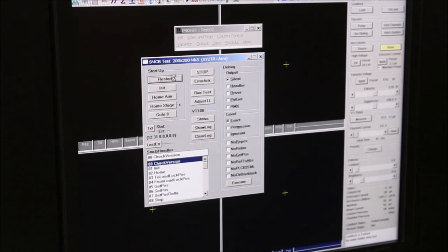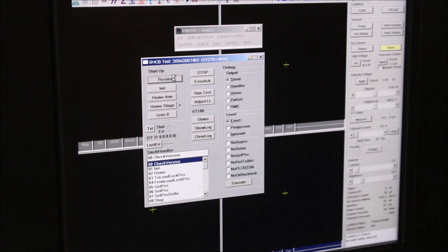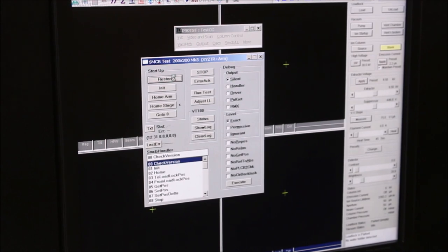Now we hear the motors going. When the sump is removed, we can hear the motors homing the stage. Now it's going to go to zero zero. If something goes wrong, we'll see some errors. We're waiting for something to settle here apparently. There it goes. Now it's going to zero zero.